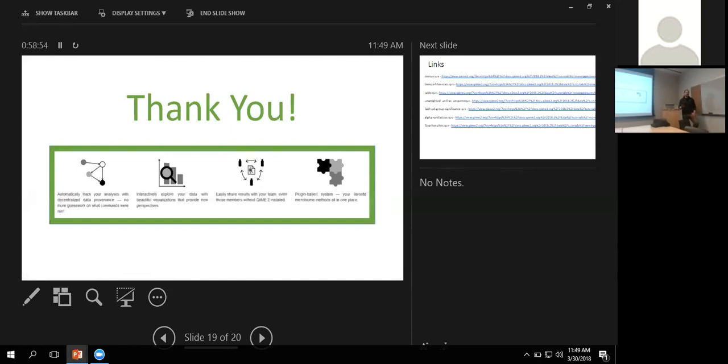But I think it works best with Illumina data. Is that the standard? They stayed away from indicating standards, I think. Yeah. So you get to struggle with that and decide on that. Right, but so what you're doing is you're clustering at a really high level, but then you're also assigning taxonomy. So now you're going to have all your taxonomic ranks and later collapse back down to your genus level. Right. You wouldn't get much additional phylogenetic signal from 99% clustering. There's not enough information for a lot of those. So, yeah, when you collapse, you lose some information.